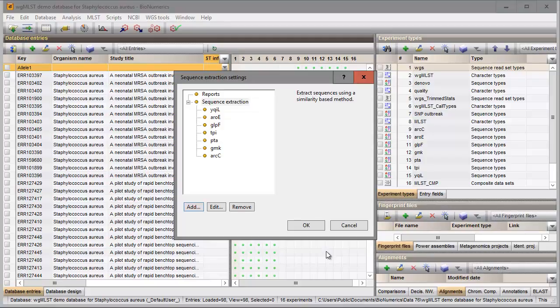The tree is updated. Optionally, the report settings can be modified. I press OK to close the wizard.